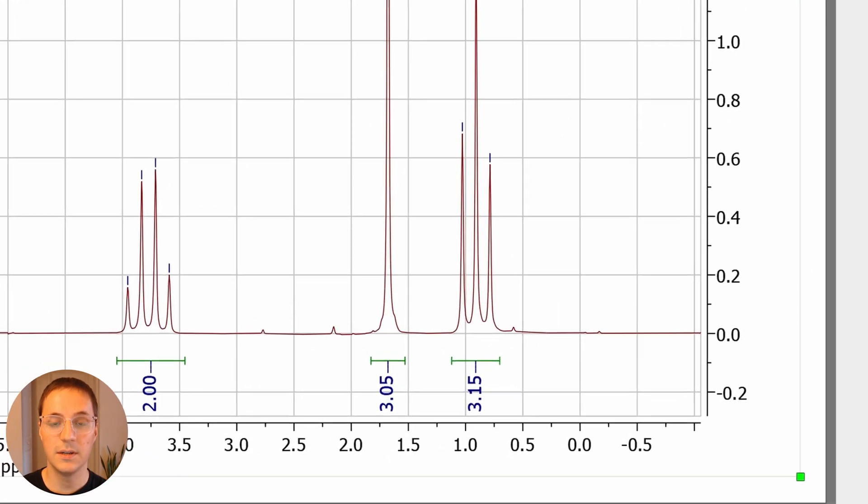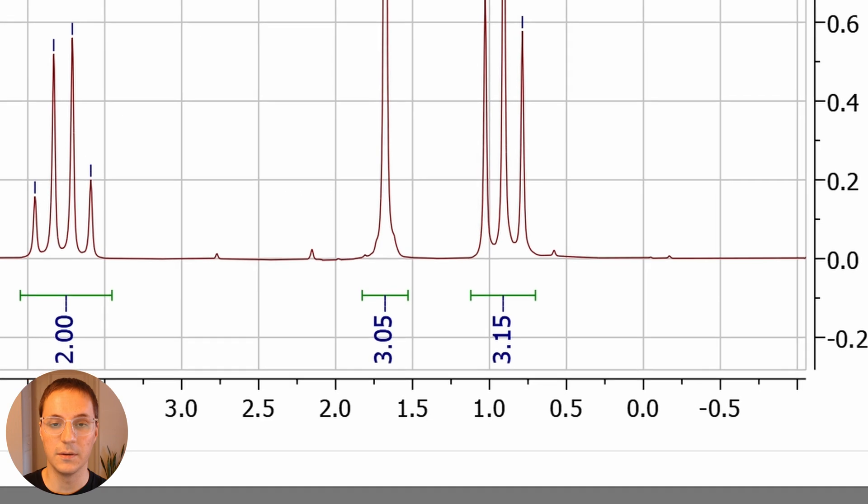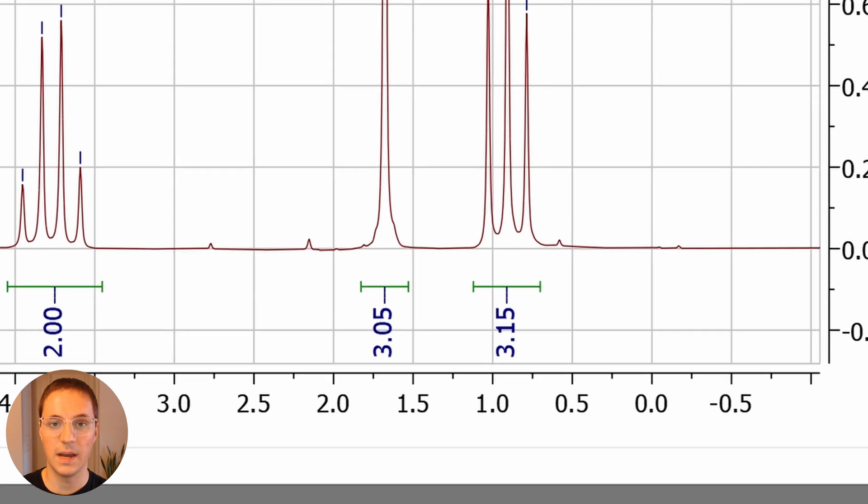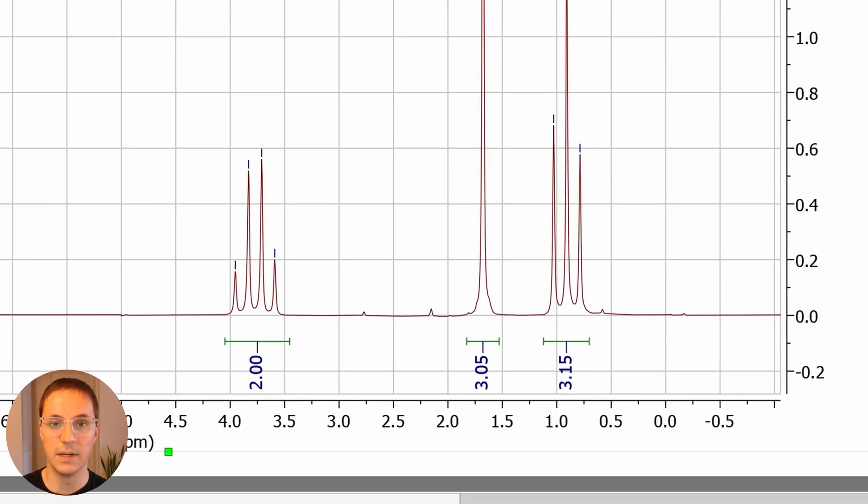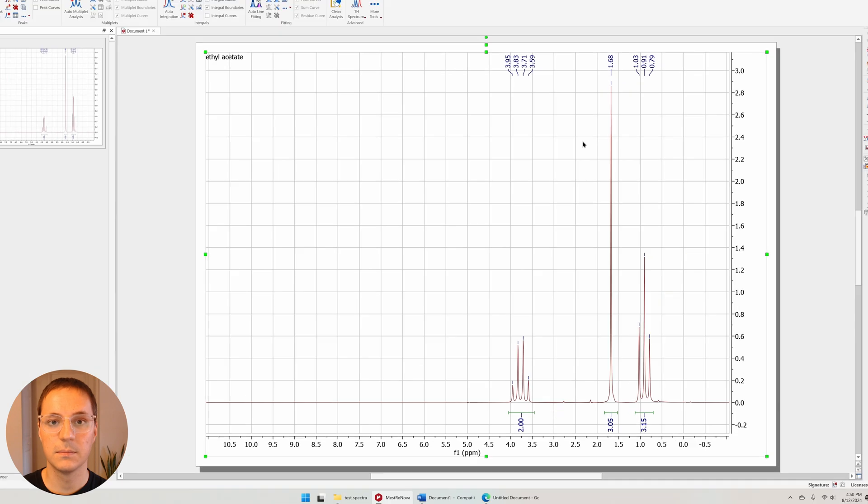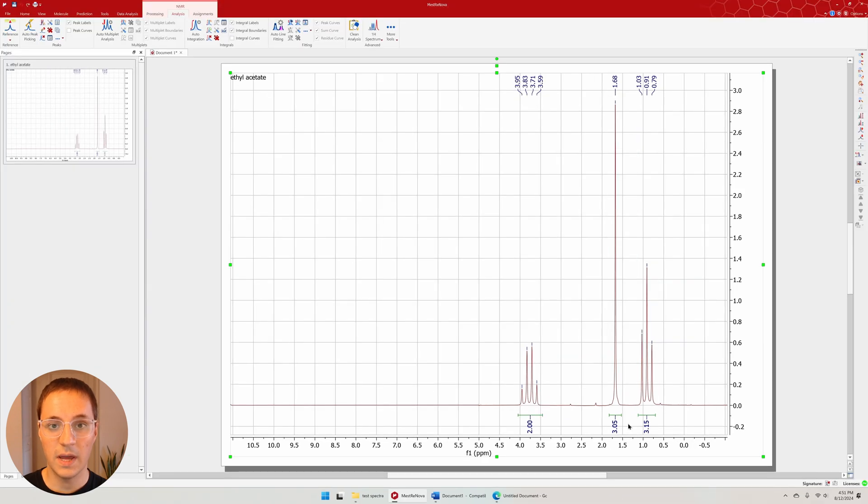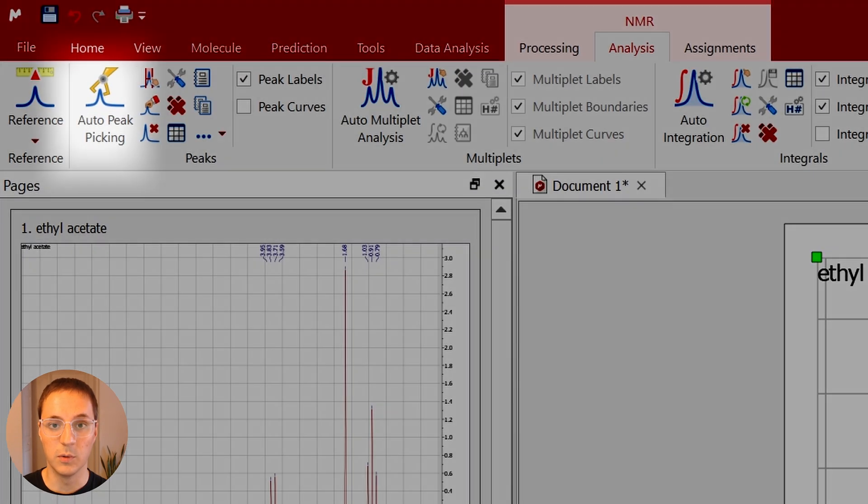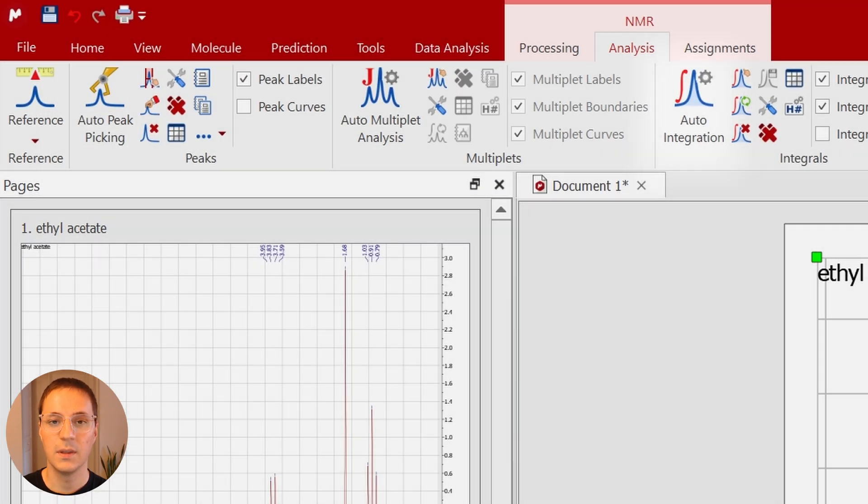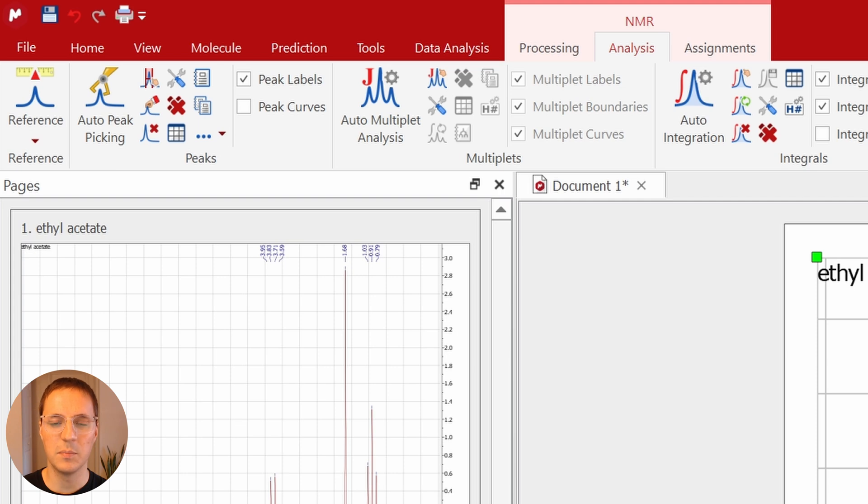You can see here these integral values aren't exact and that's likely due to where we drew the integration bounds. There are automatic functions for both peak picking and integration. You can try using these, but they'll often pick and label more than you want.